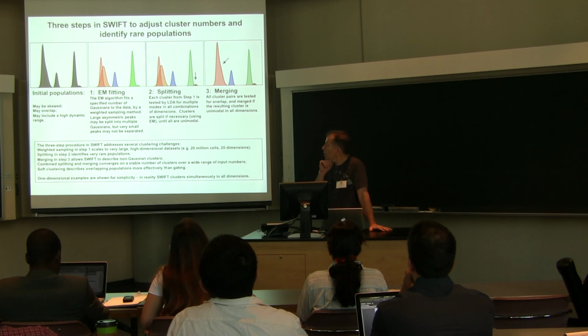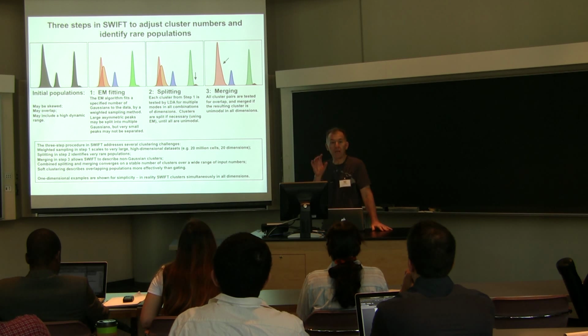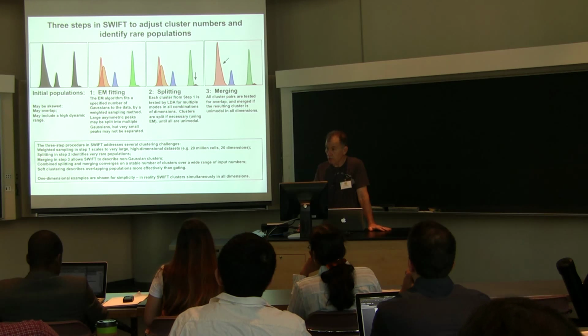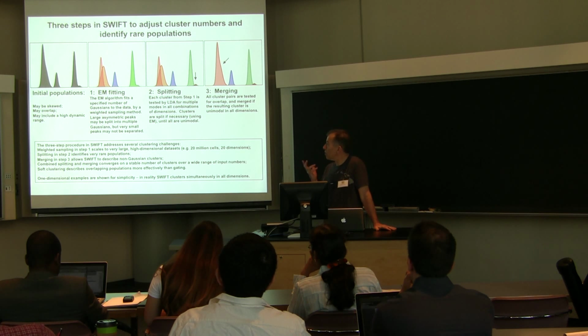For the first step, Gaurav and Iftikhar designed this step using the expectation maximization algorithm. I'm not going to be able to explain the mathematics in any detail, but I can tell you the principles of how it works. It's a model-based algorithm like the k-means that Richard described, where you have to tell the program how many clusters you expect, and then it optimizes that number of clusters to your data. That can be very computationally expensive, even though it does a good job.